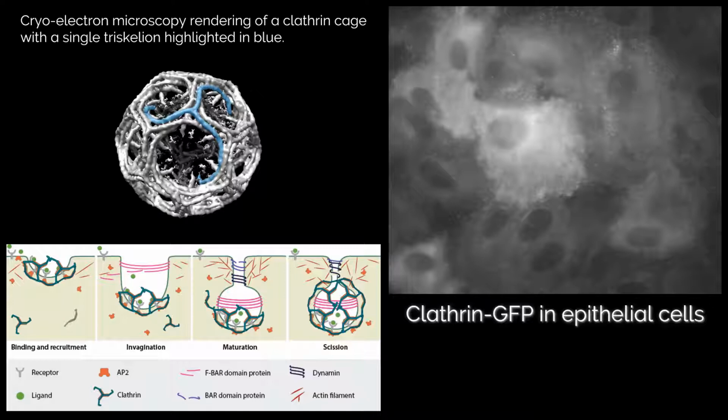Many researchers are trying to tease out the kinetic details of clathrin-mediated endocytosis using multicolored fluorescence microscopy, coupled with protein gene modification techniques. But again, the cellular fog generated by wide-field epi-illumination makes this a difficult task.